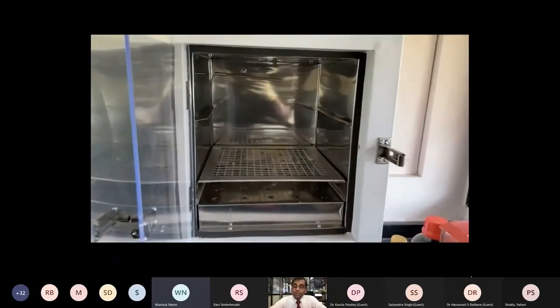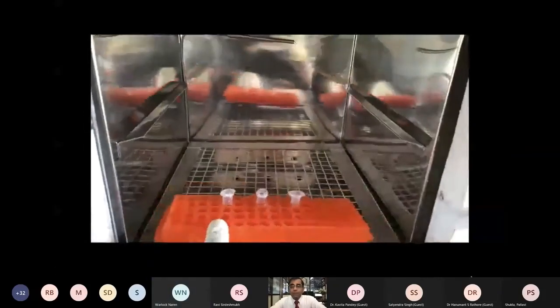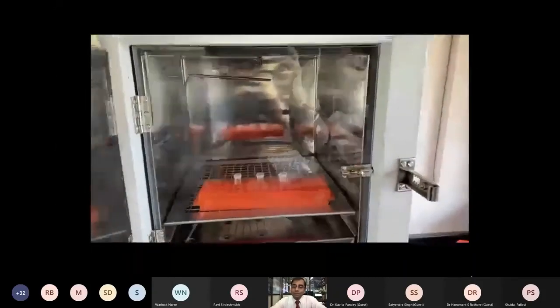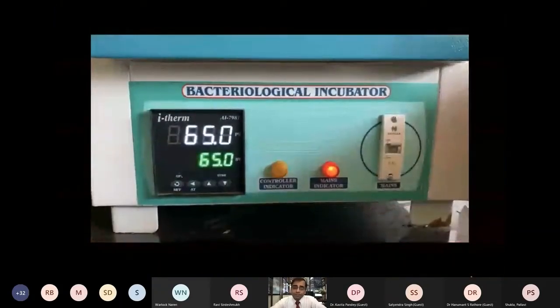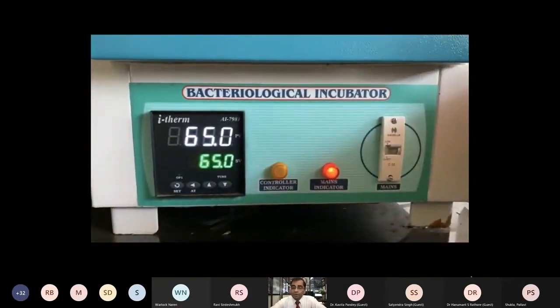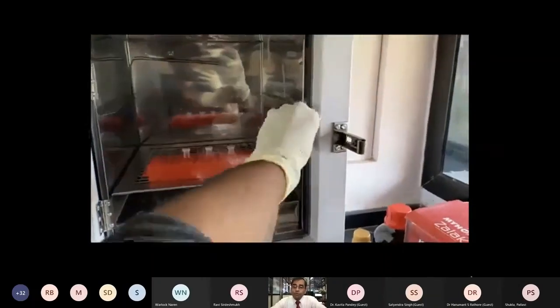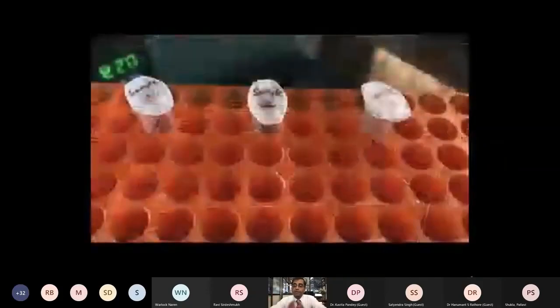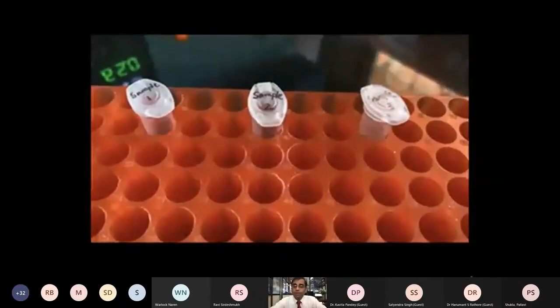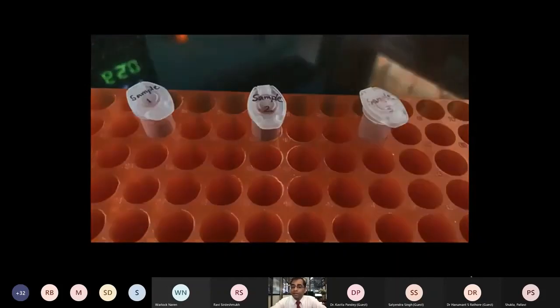First, the nasopharyngeal swab samples, we are keeping them in the heat incubator so that the virus can be inactivated. As per WHO guideline and some Lancet papers, if you keep these samples at 65 degrees for half an hour, that is safe to work with. And now we kept the whole assembly, including our trays and racks, so that if there's any spillover, it could all be inactivated.